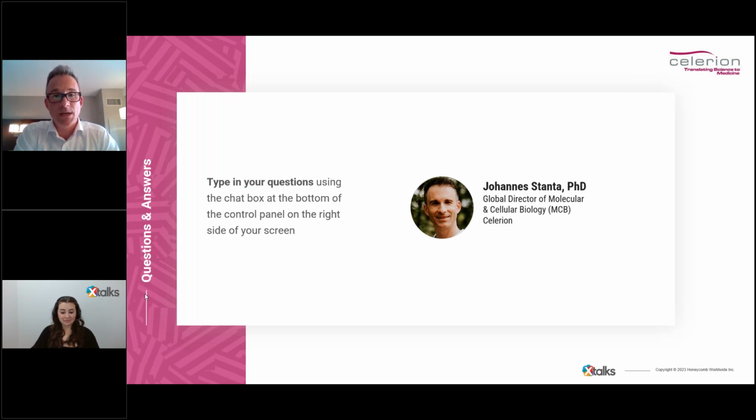This can be completed. There's very little points in between where we need to pause and take a step back and think about what we're going to do next. Because of the unique context of use of the shedding assay, this can be very easily pre-planned and put together, and then just processed and done in the lab very, very quickly.